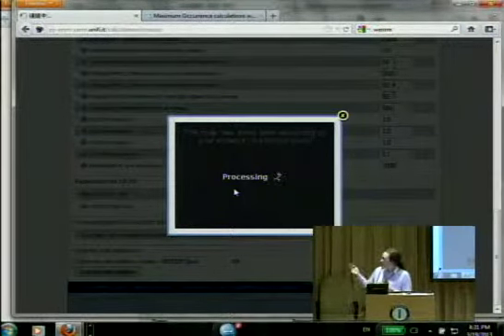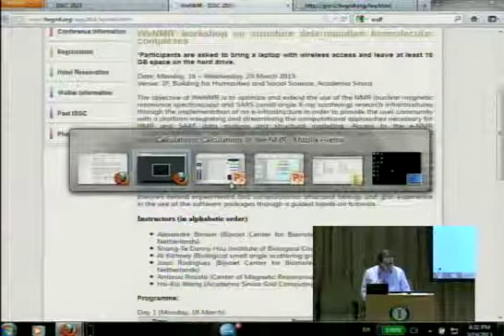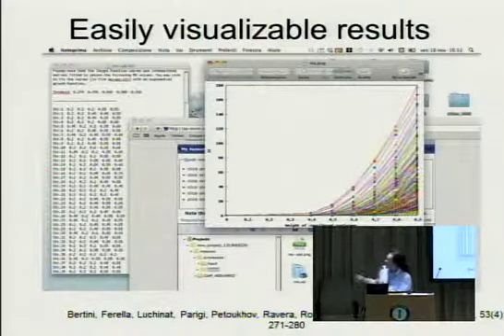So just to give you a feeling, this is the kind of stuff you get out of it. For example, you get a pre-computed plot with all the curves that I was showing you before. And of course, you also get the corresponding numerical data if you want to run. So you get the image, but more importantly, I would say you actually do get the data there.